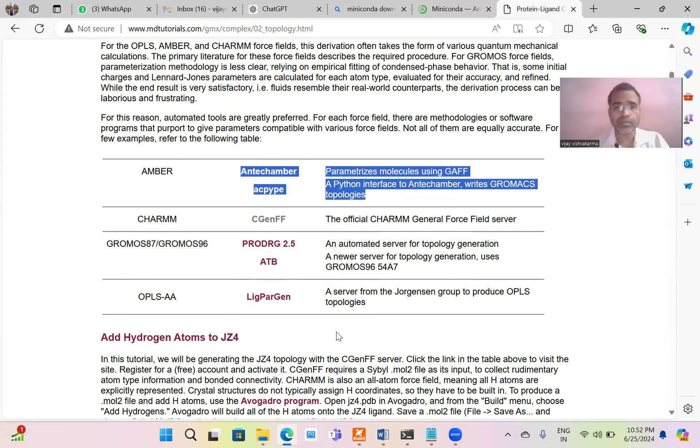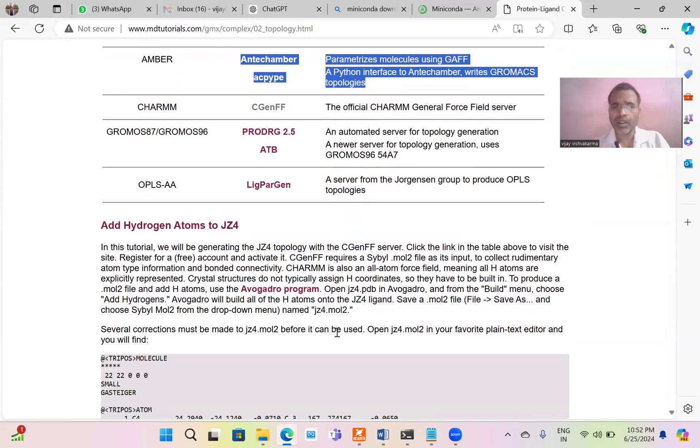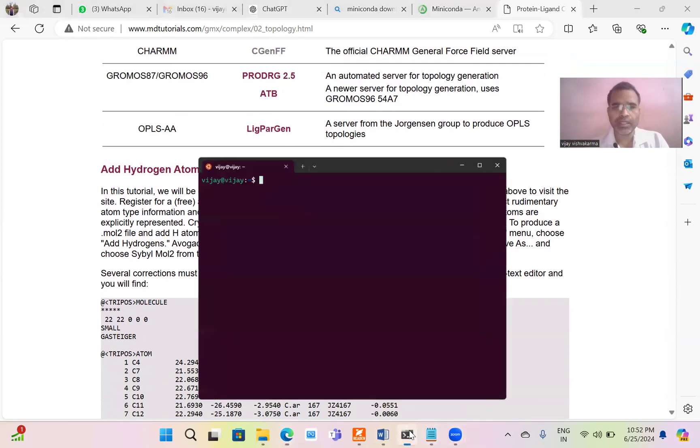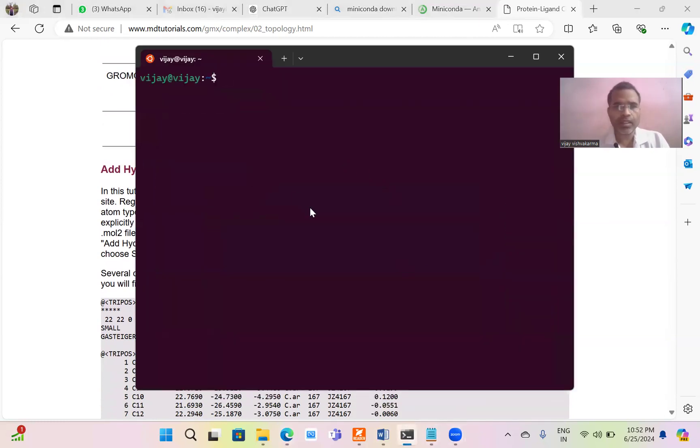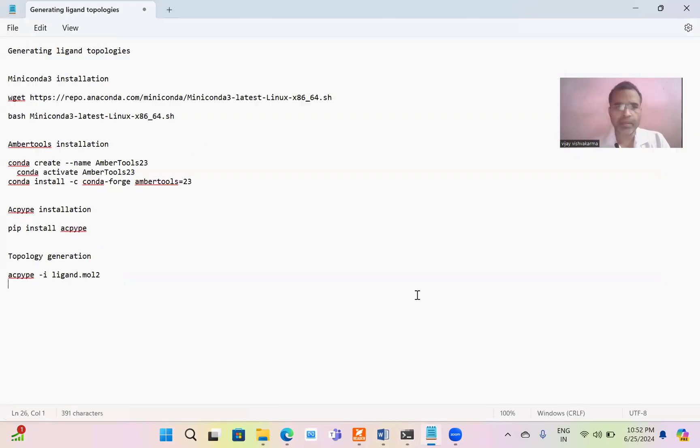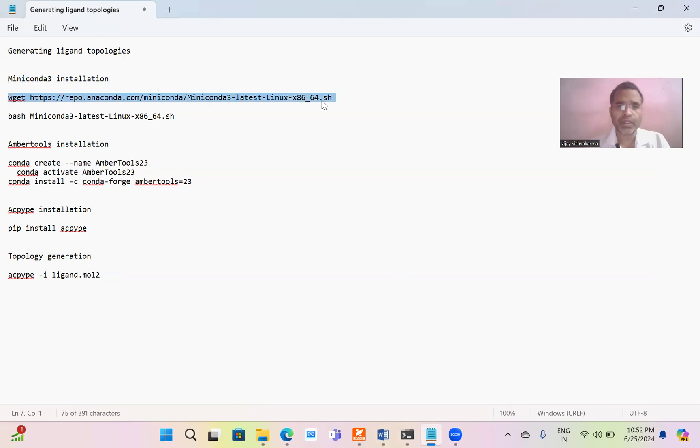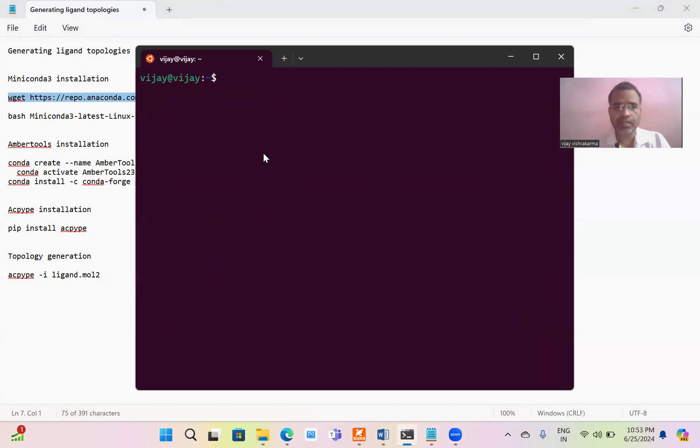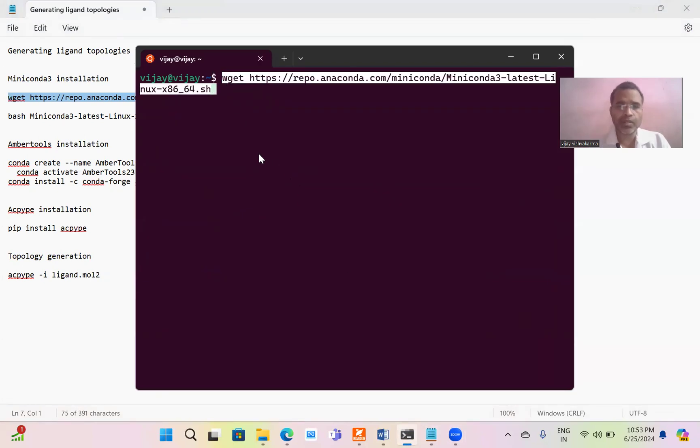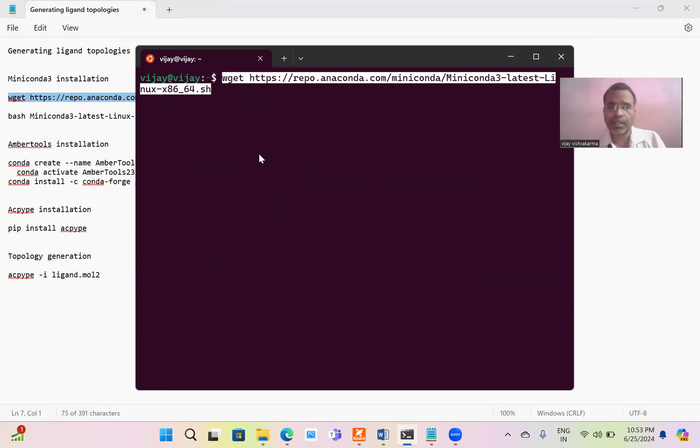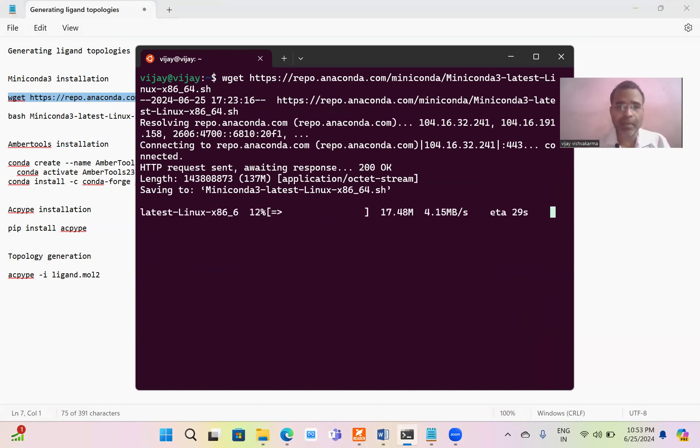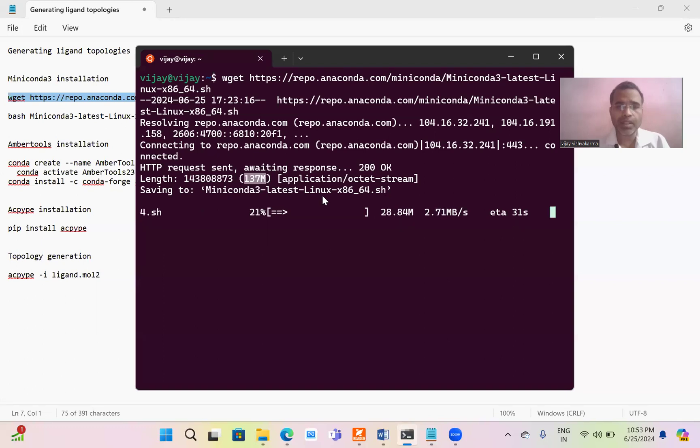First of all we have to install the Miniconda for this. I have a script for the installation of Miniconda. We have to download the Miniconda, so just copy this. This is the latest Miniconda download. You do not need to check with the website. Just press enter. It will download approximately 137 MB file. Just wait once the download is completed.